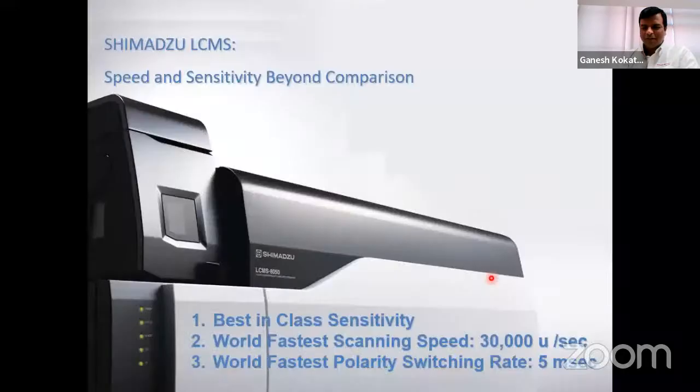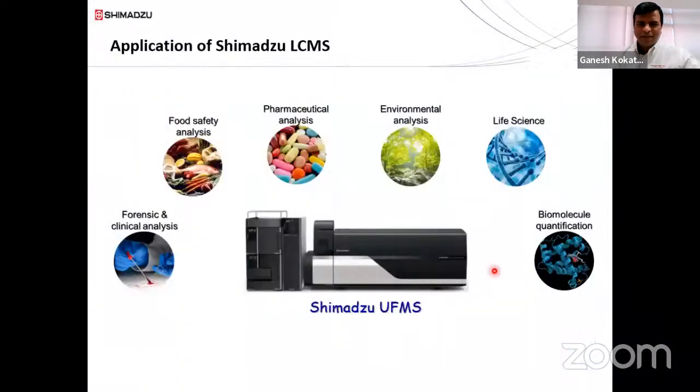Okay, fine. So what I will do, I will cover the application part. So main part, applications. Normally, LCMS applications are touching all the peripheries, starting from the clinical trials, forensic chemistry, food and safety analysis. Now it's booming like anything.